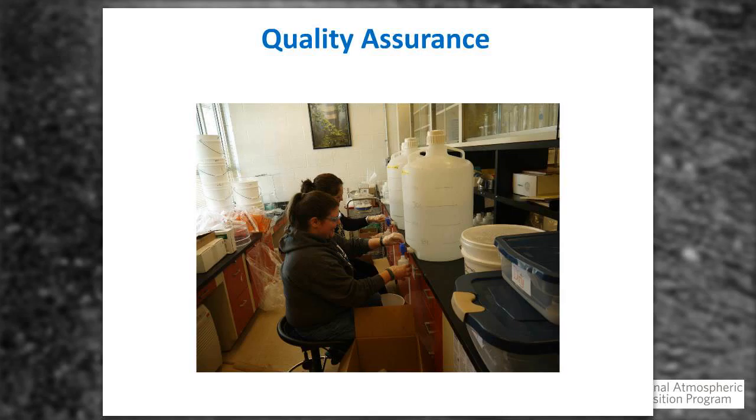Quality assurance, we've highlighted that. This is a picture of our quality assurance lab. It's Katie Blades, who runs our ICP in the foreground, Lee Green, who runs our ion chromatograph in the background. They're actually bottling up quality assurance solution. We work with the World Meteorological Organization, and we provide test solutions to labs around the world. That allows our data to be directly compared to programs throughout the world.